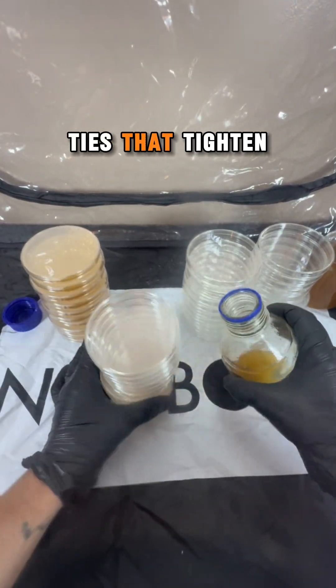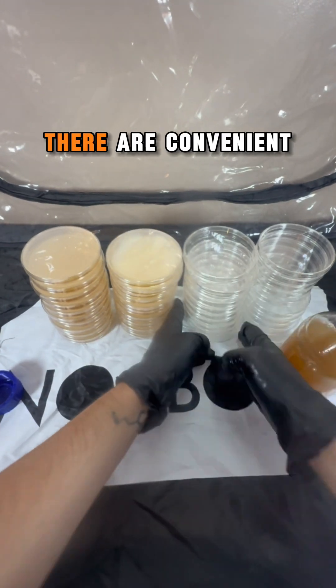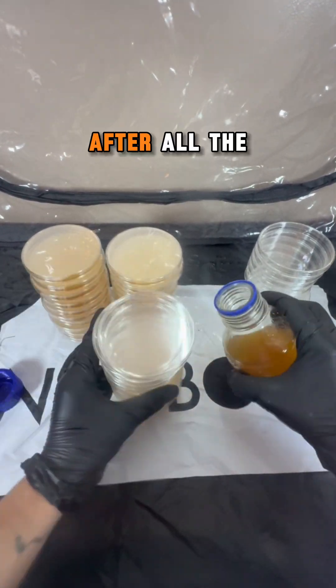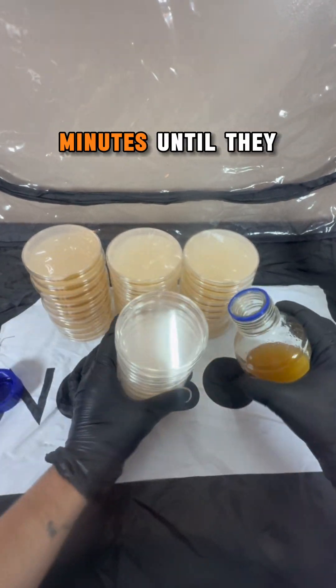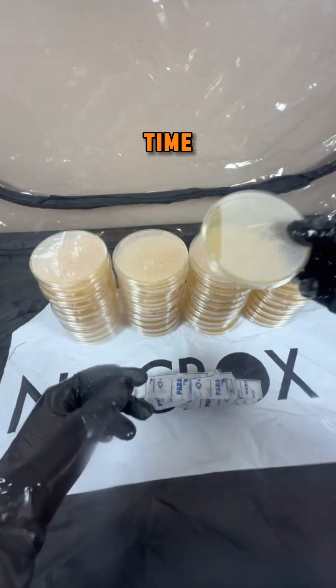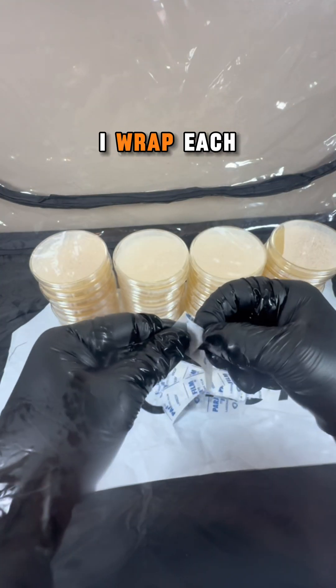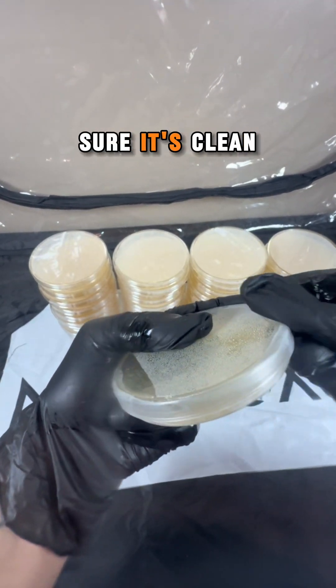The knock box has two arm holes with ties that tighten around your arms, and if you're working with large items like substrate, there are convenient zipper openings to bring them in. After all the plates have been poured, I leave them in the knock box for about 45 minutes until they solidify. The arm holes are closed during this time.